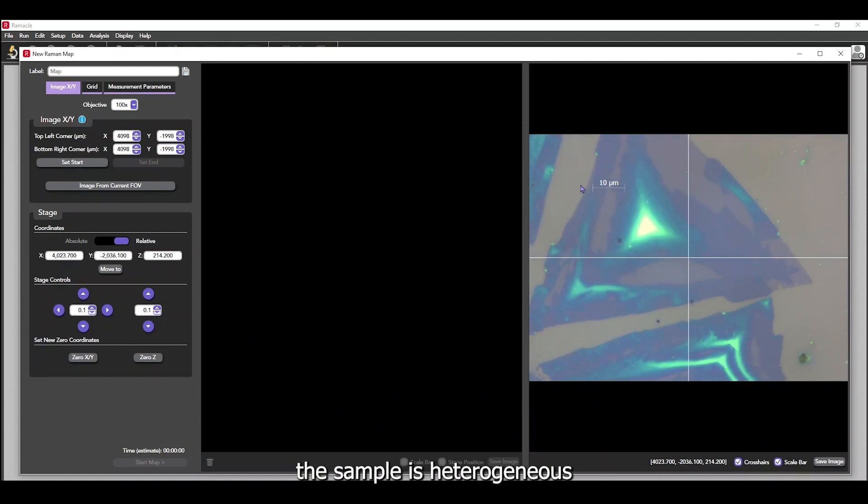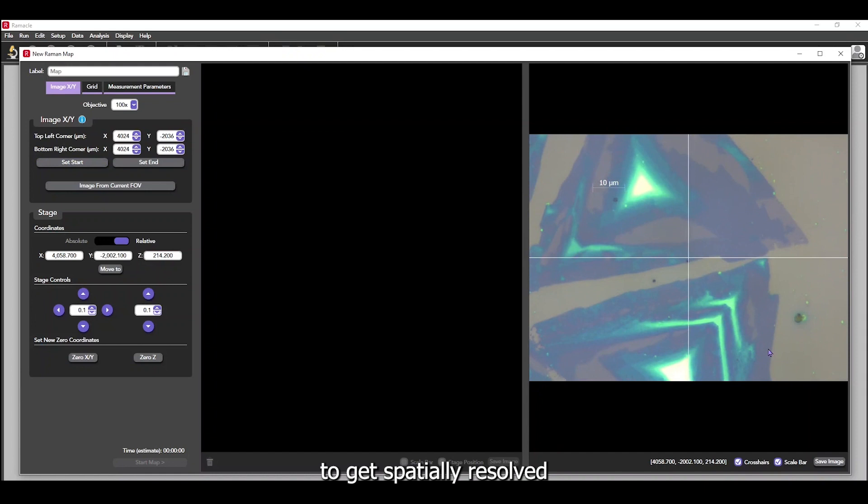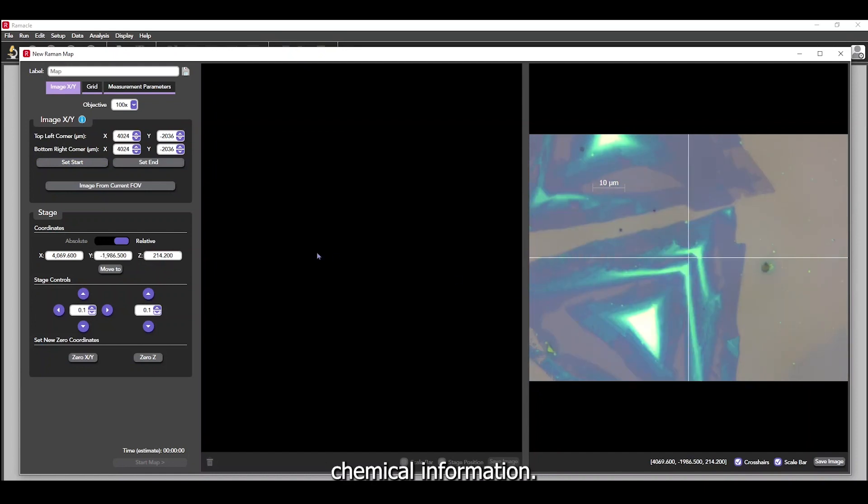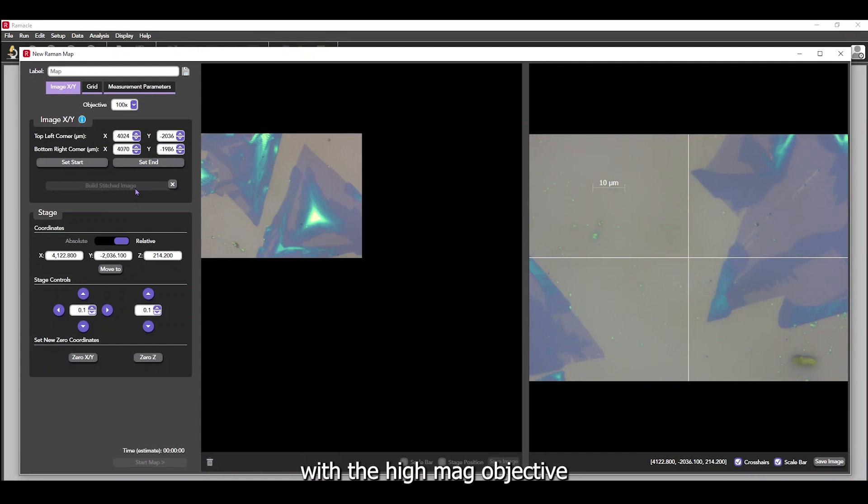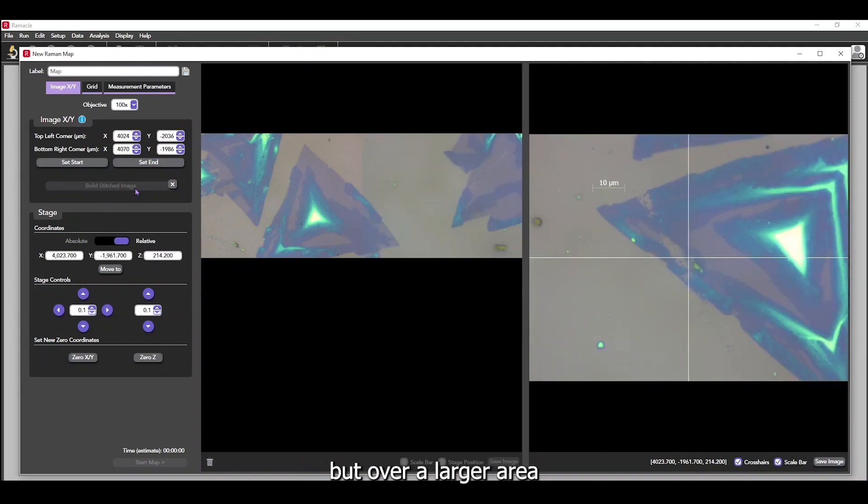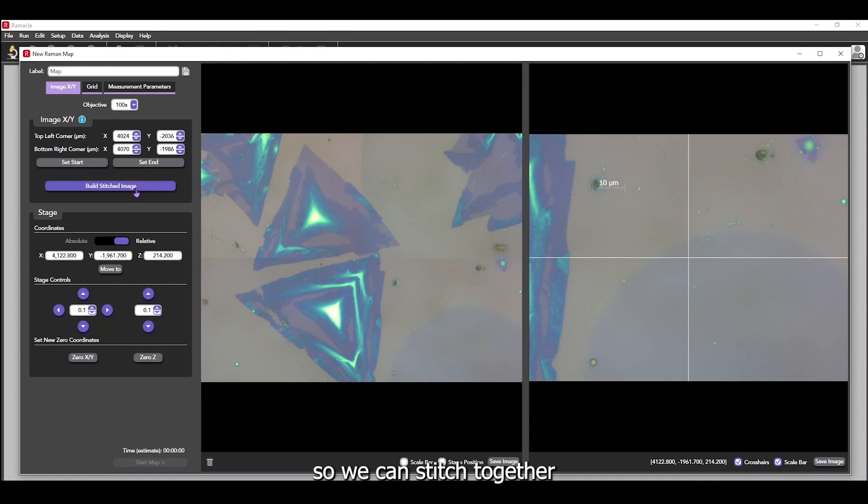Now that we know that the sample is heterogeneous and produces a Raman response, it's time to map it to get spatially resolved chemical information. Here, we want to perform our map with the high mag objective, but over a larger area than the narrow field of view shows. So we can stitch together multiple fields of view images.